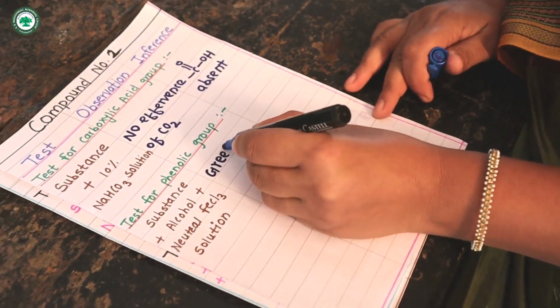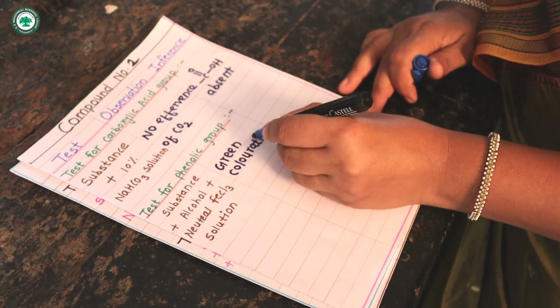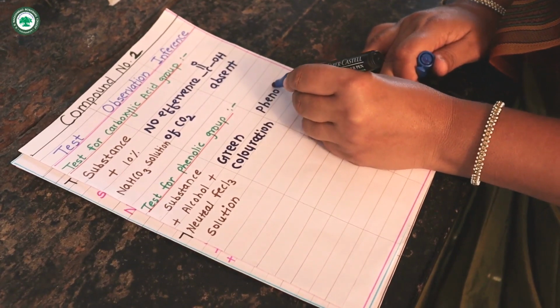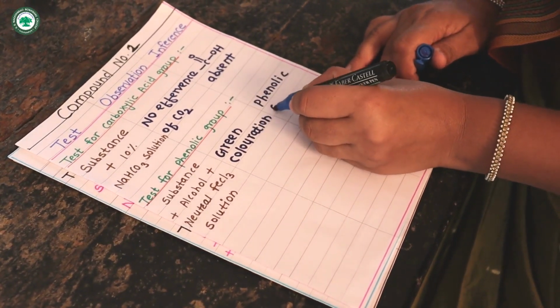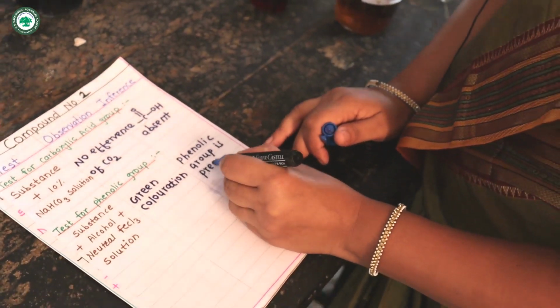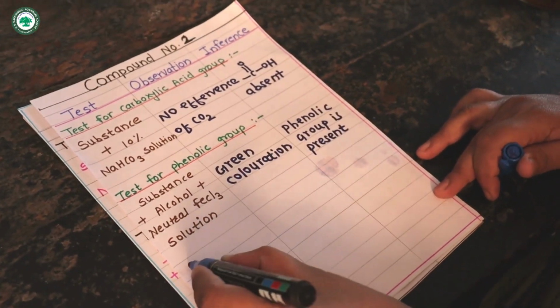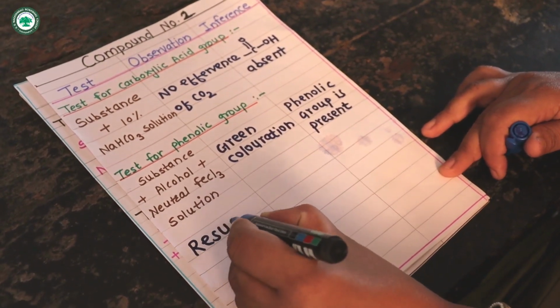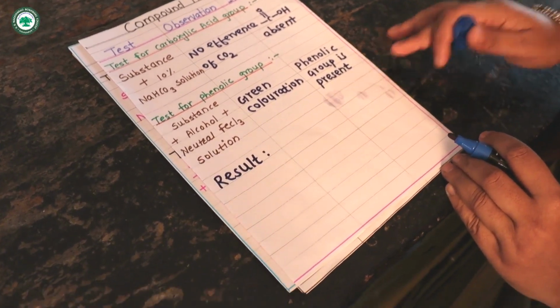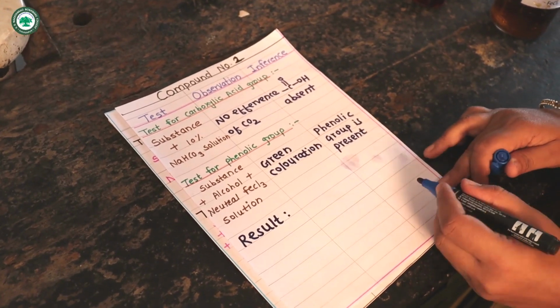Green color. Green coloration. Therefore, phenolic group is present. Then write result of compound second. There is no need to take next test because functional group is phenolic OH group. Our compound contains only one functional group.